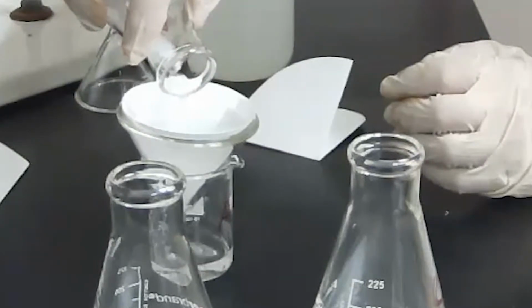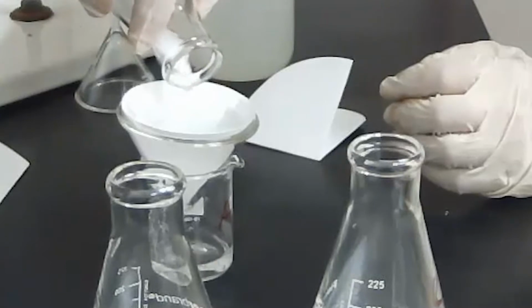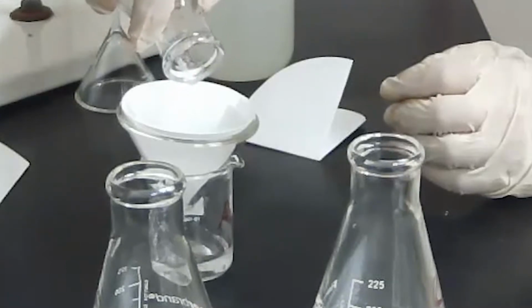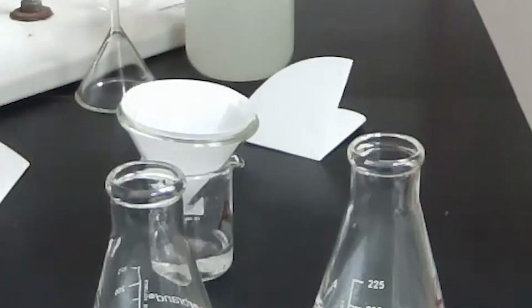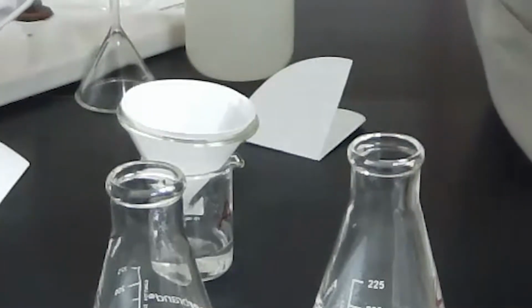Now, if your lab manual says try not to get any of this on you, you'll notice I'm not only wearing a lab coat, which is super snazzy, I'm wearing gloves and goggles because for some reason, even wearing gloves, sometimes I get silver burns.